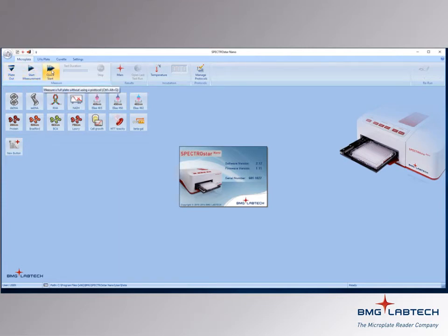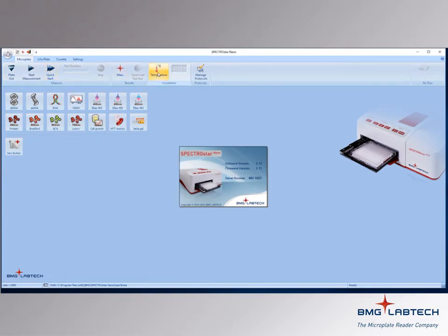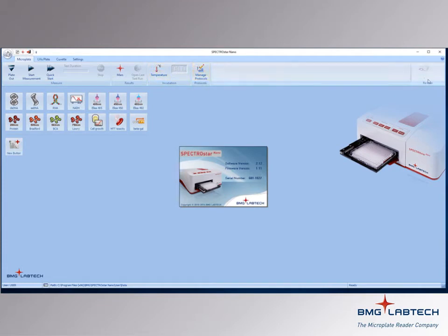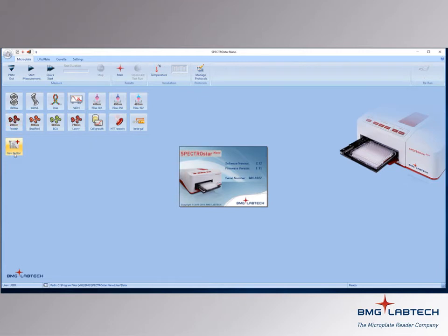MARS can be opened, temperature can be controlled, protocols managed, and the last completed test run can be rerun. Some common absorbance assays can be run with predestinated protocol buttons, and new buttons can be made from user-defined protocols that you select.